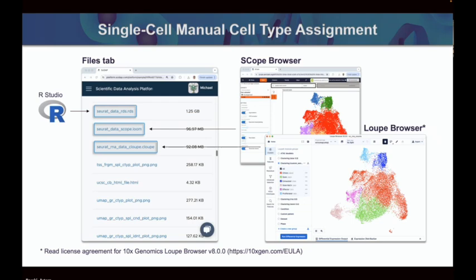We had a talk several months ago about some of the tools in Python. It looked like they're coming along quite nicely. I'm sure they're still lagging behind R, but it looked very promising, more performant and more integrative. That package is written by a postdoc from Nathan Salomonis's lab. It's called cellHarmony, but we still run it from R just to keep everything consistent. But thanks to CWL, our pipelines are language agnostic. And you should be, but I just wondered about the back end.